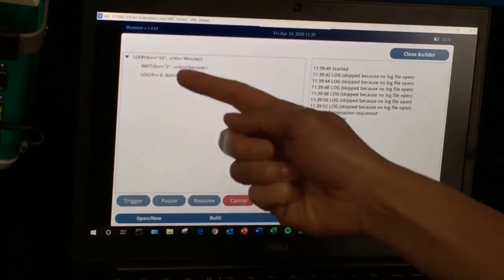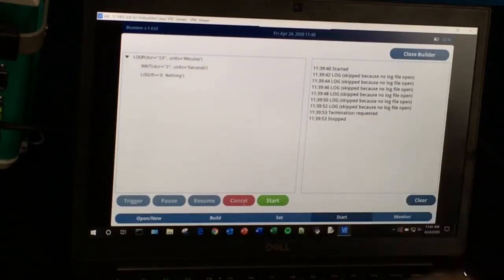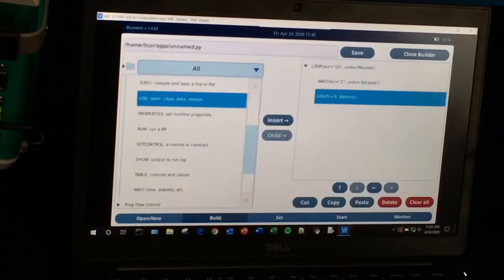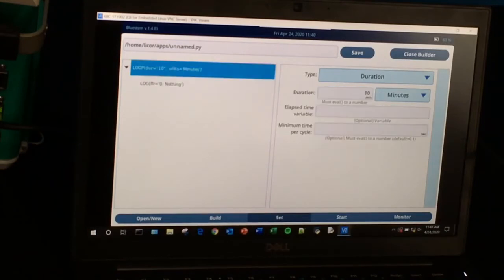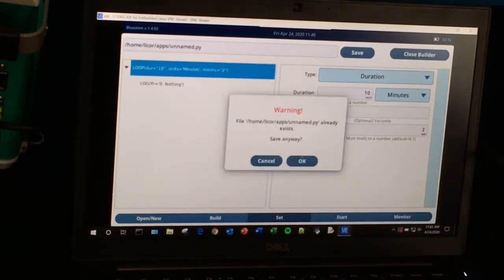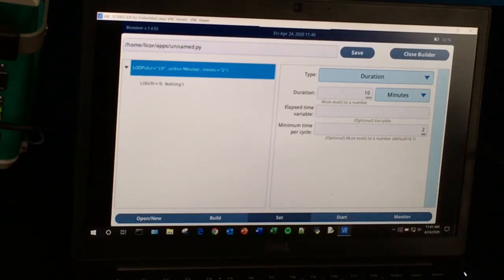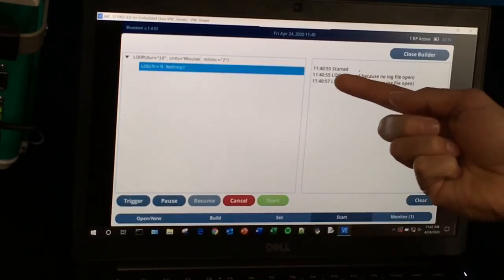Now, let's say you have more things inside this loop and some of those things take a little longer. You might notice that although you set a wait for two seconds, it's not logging every two seconds — maybe it's logging every three seconds. A better practice than using a wait is to use a different statement. We'll go back into the build screen and delete this wait. Then we'll go back to the Set screen, go up to the loop, and utilize the Minimum Time Per Cycle setting. I'll set this to two seconds. We'll save, go back to the Start menu, clear, and start the program. You can see it's still logging every two seconds — the same result.